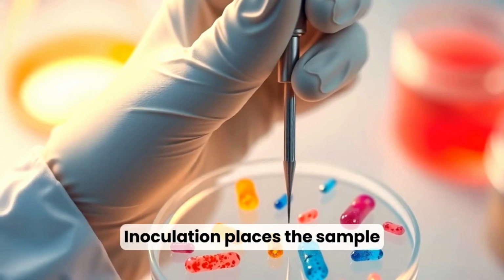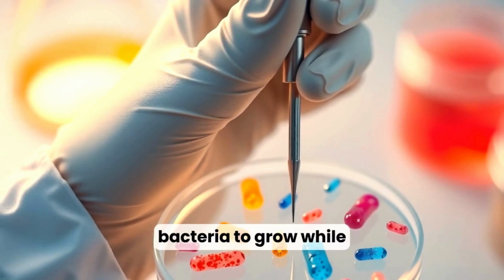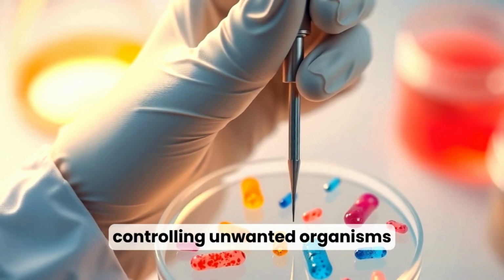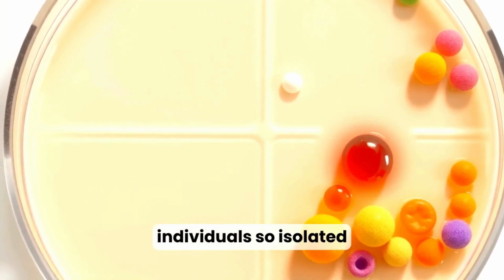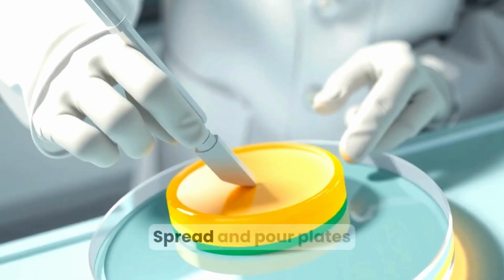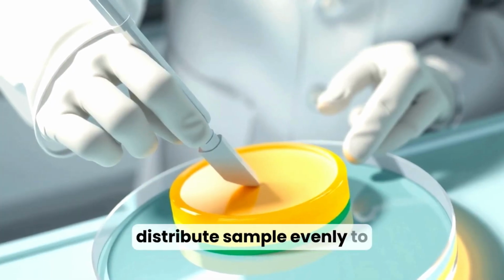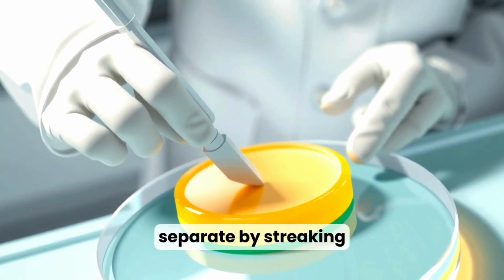Inoculation places the sample on or into growth media. The goal is to encourage target bacteria to grow while controlling unwanted organisms. The streak plate method spreads cells to separate individuals so isolated colonies can form from single cells or clumps. Spread and pour plates distribute sample evenly to estimate quantity and recover organisms that are harder to separate by streaking.